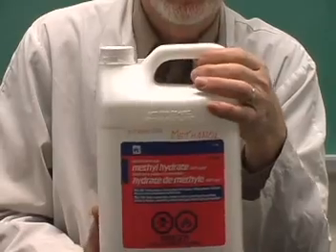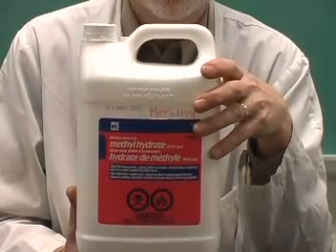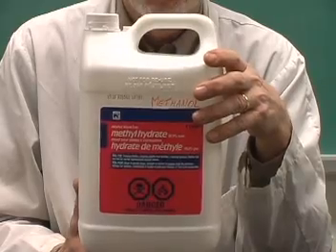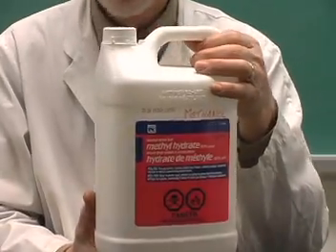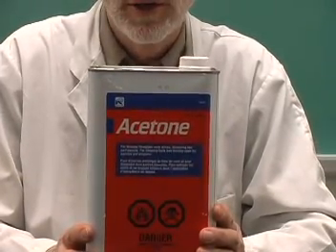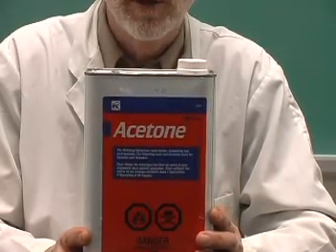Another important reagent that is used in alcohol burners and in many of the demonstrations is methanol or methyl hydrate, as it's commonly called. It's available in the paint section of a hardware store. Acetone is another solvent that may be used periodically. It's certainly not as common. It's also flammable, so you don't want to keep very much of that around.